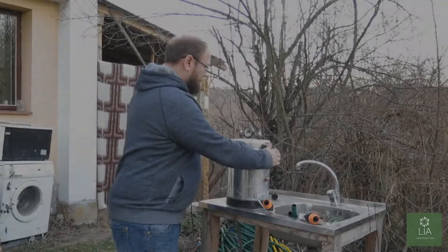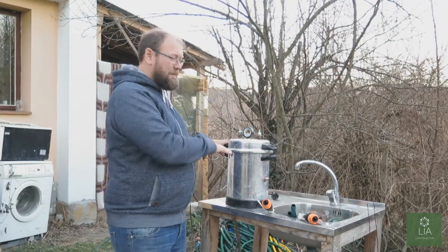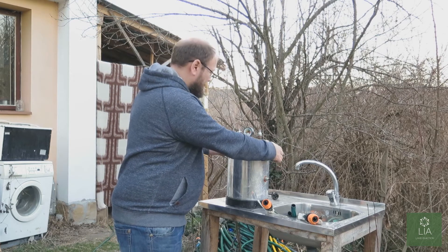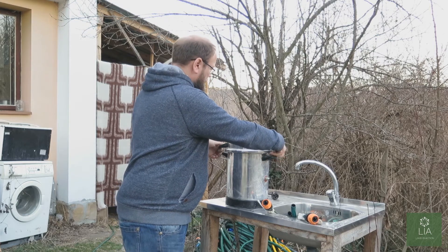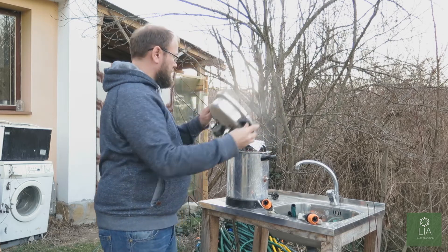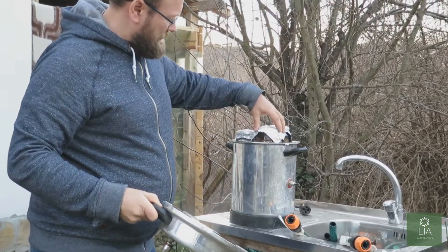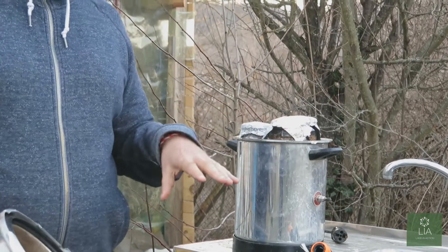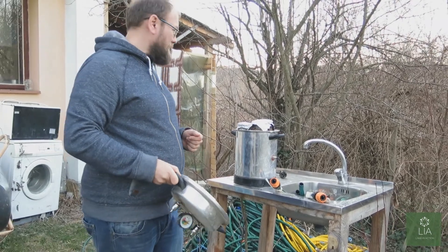These jars have now been in the pressure cooker for one hour at 15 psi. We've already released the pressure and we can pop it open. Now we're going to lift the jars out, let them cool, and keep filling up the machine until we've finished everything.